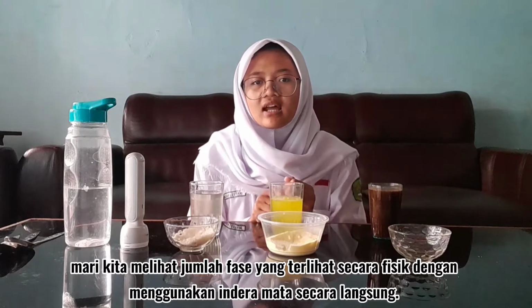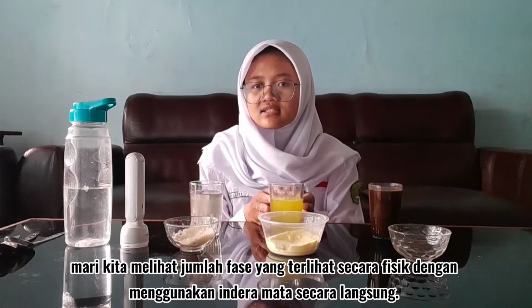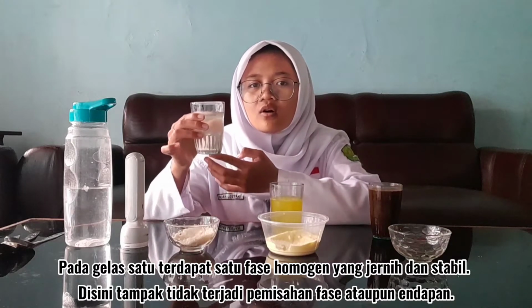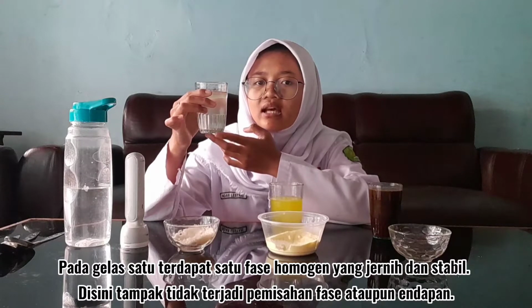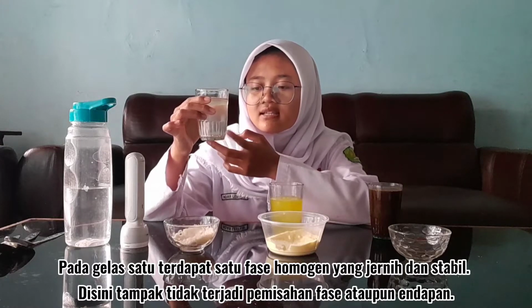Let's look at the number of phases that are physically visible using the eyes directly. In glass 1, there is a clear and stable homogeneous phase. Here it appears that there is no separation of phases or precipitate.